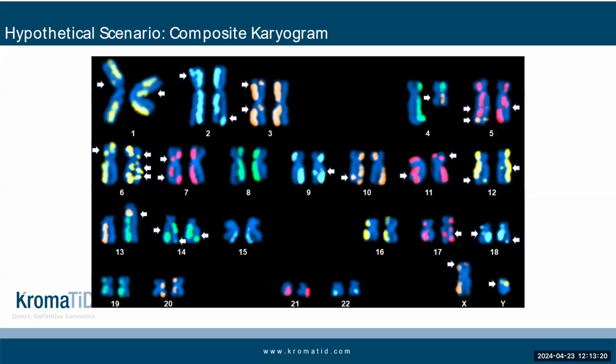A complex abnormal cell such as this one can represent a serious challenge to many assays. Array CGH generates gain and loss data, so it wouldn't detect balanced translocations. G-banding would be very hard-pressed to catch small insertions, as well as several of the small inversions present.